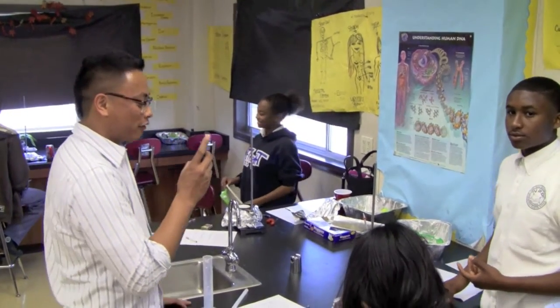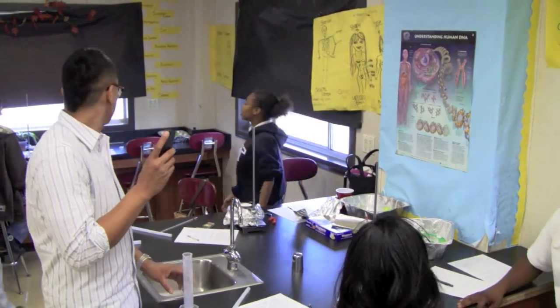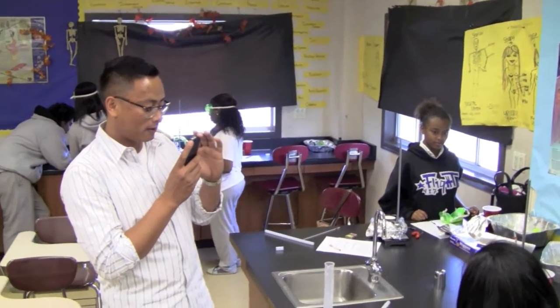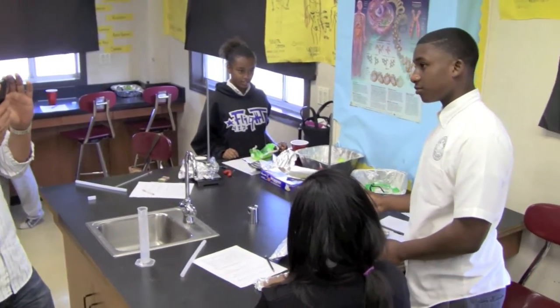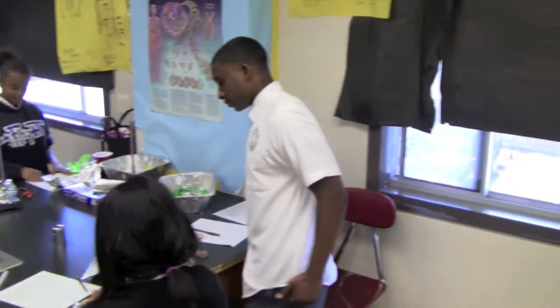Okay. What kind of food are you guys testing? We're testing peanuts, hot Cheetos, and marshmallow. Okay. Which one had the most energy so far? So far, the Cheetos. What was your prediction? That's a marshmallow. I thought the peanut was good. No, actually, so both of you guys are wrong? Yeah, we were. Okay, that's okay. Alright, thank you guys.